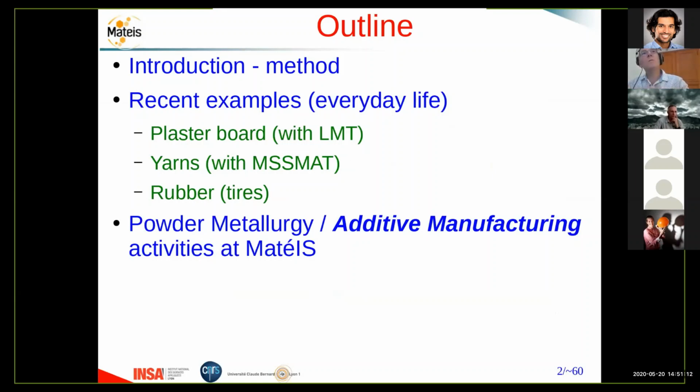There is no procedure available to give us at the same time the good precision that we need to see the markers to be able to make the DVC experiments and sufficient time resolution. But still, from static and quasi-static studies, what we plan to do is compression and also compression and torsion.